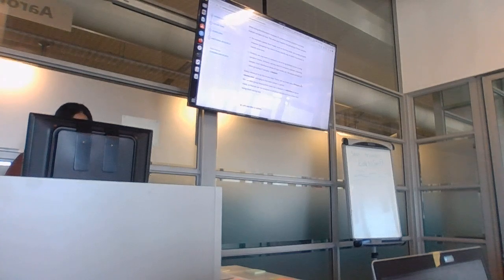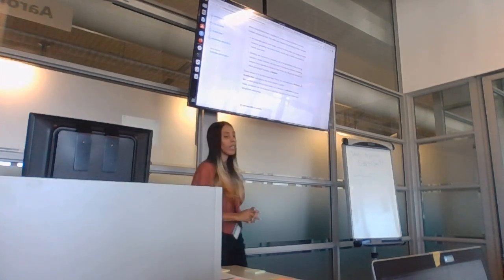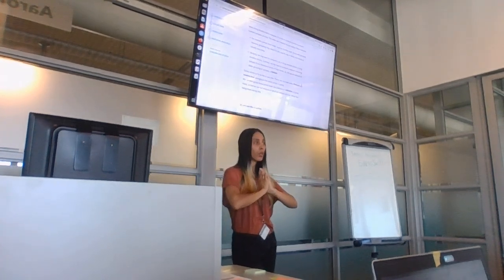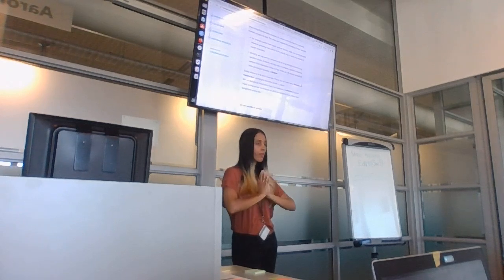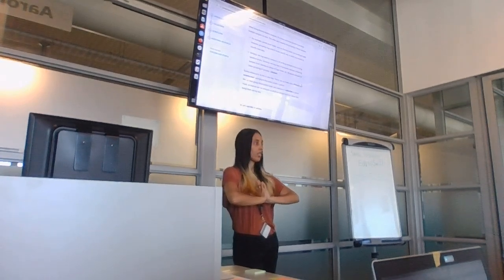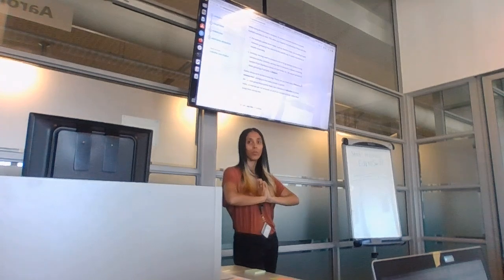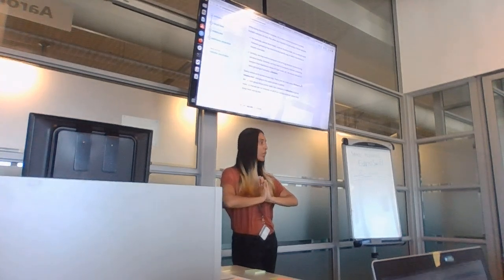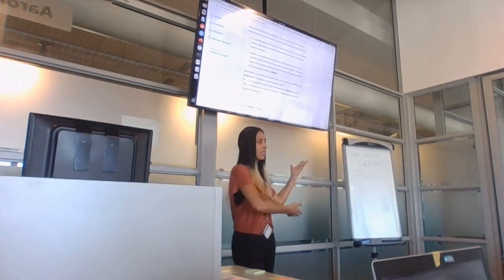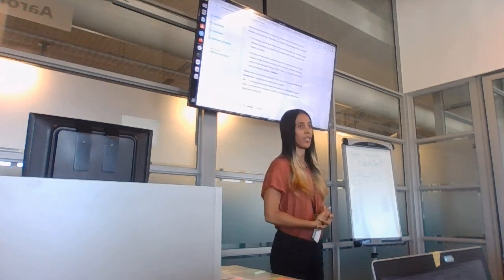So, in Galaxy, fortunately, you can do two things at once. If you've got, for example, an Illumina dataset, firstly, why would you even want to put them in a dataset? For those of you who have worked on the command line before, maybe it would make sense why you would want to put it into a dataset. What would be different to having it in a dataset in terms of analysis?